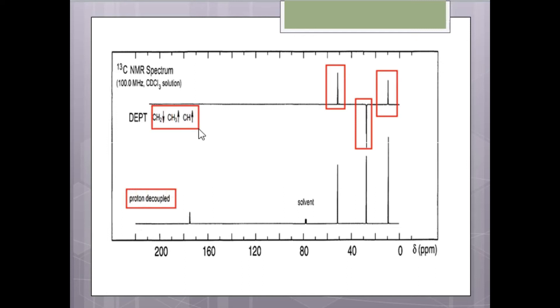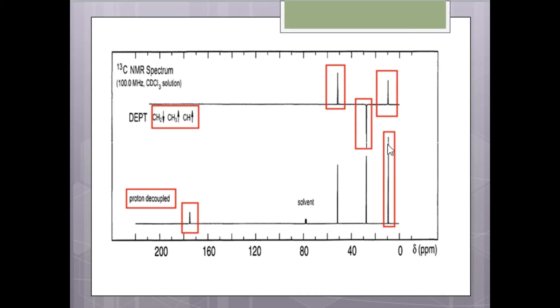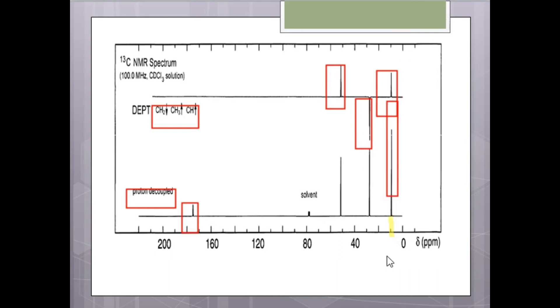DEPT does not give us information about quaternary carbon; it only gives information about CH2, CH3, and CH. But the proton-decoupled spectrum also gives information about quaternary carbon, which is a carbon not attached to any hydrogen atom. There are three peaks in the proton-decoupled spectrum corresponding to our DEPT spectrum. One peak gives us information about the methyl carbon at about 10 ppm.